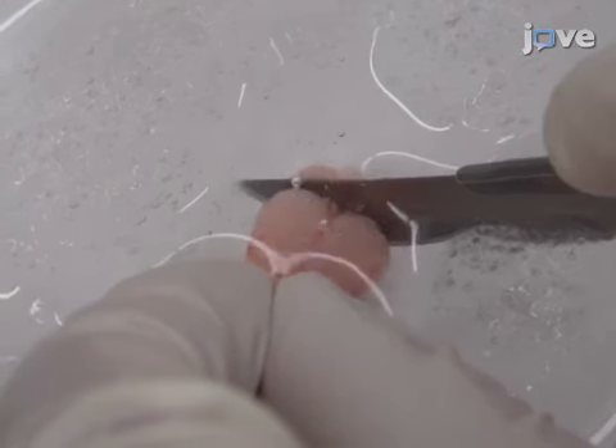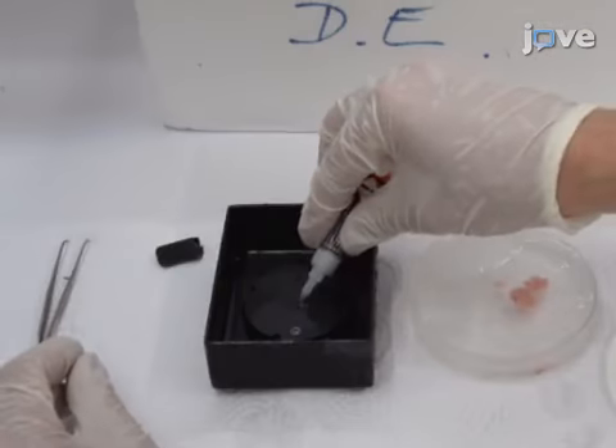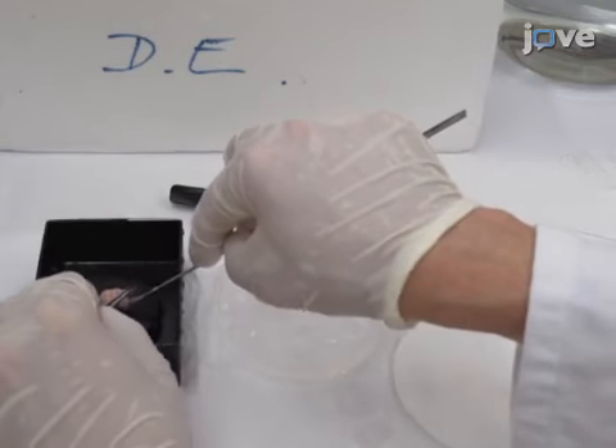To prepare coronal slices, make two cuts to remove the cerebellum and the rostral part of the brain. Then, apply cyanoacrylate glue on the specimen tray and glue the brain block to the tray such that the rostral part faces the slicing stage.